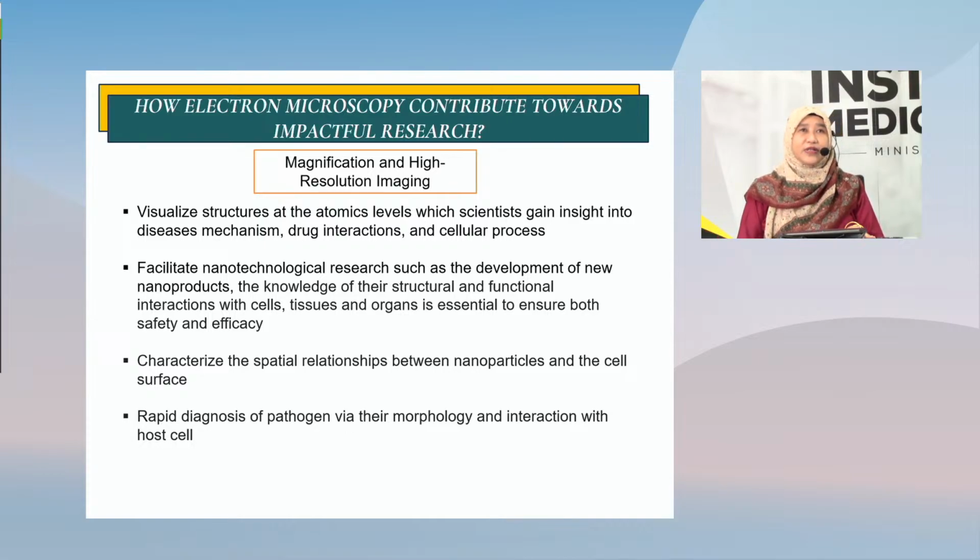Okay, how does electron microscopy contribute toward impactful research? With the advancements in other technologies, for example in molecular technology, such as NGS, metagenomics, metatranscriptomics, or these omic revolutions, is electron microscopy still relevant in biomedical research?